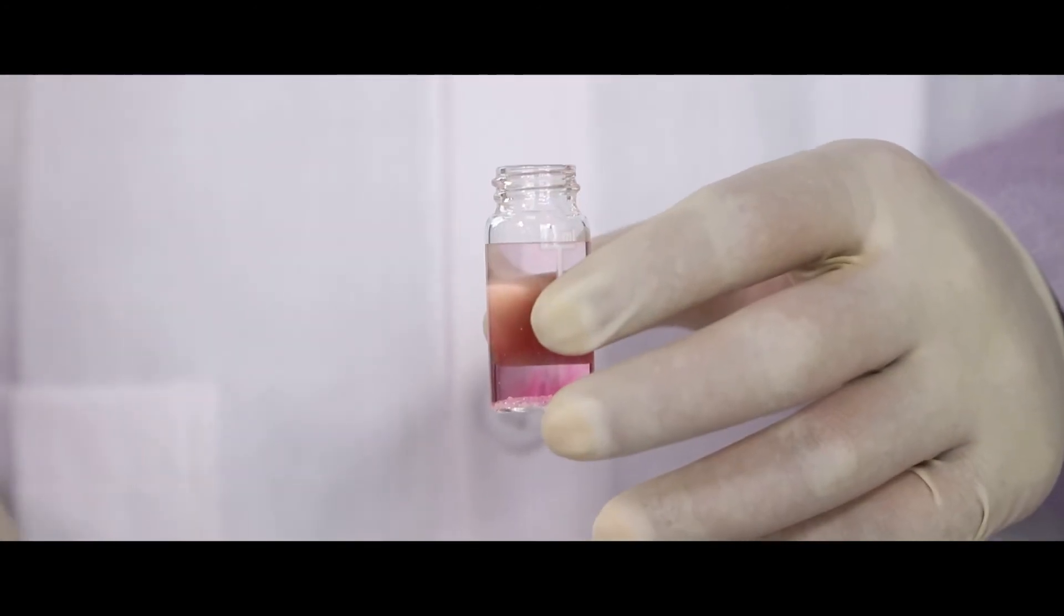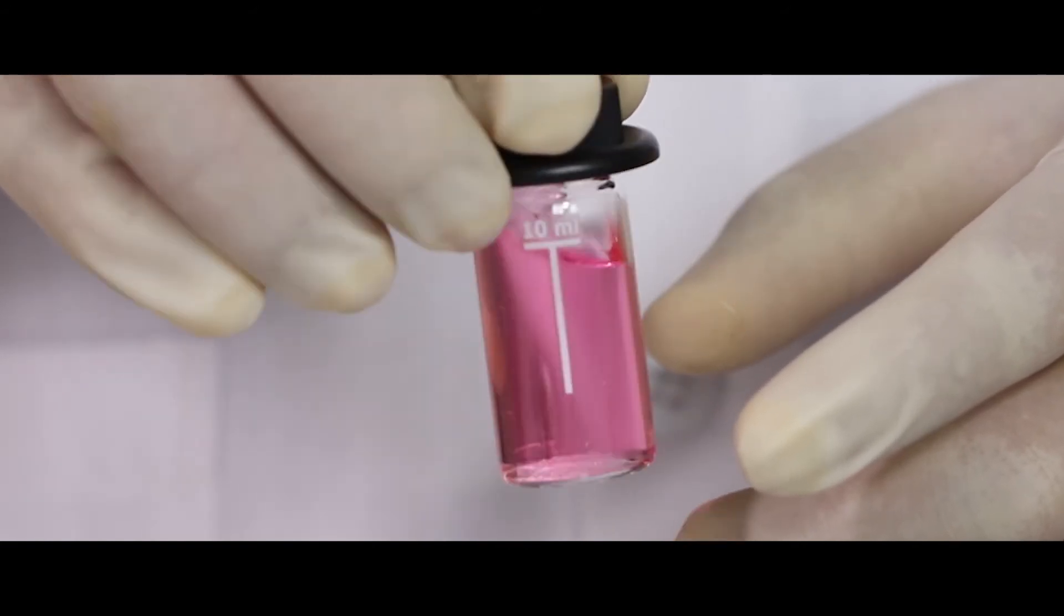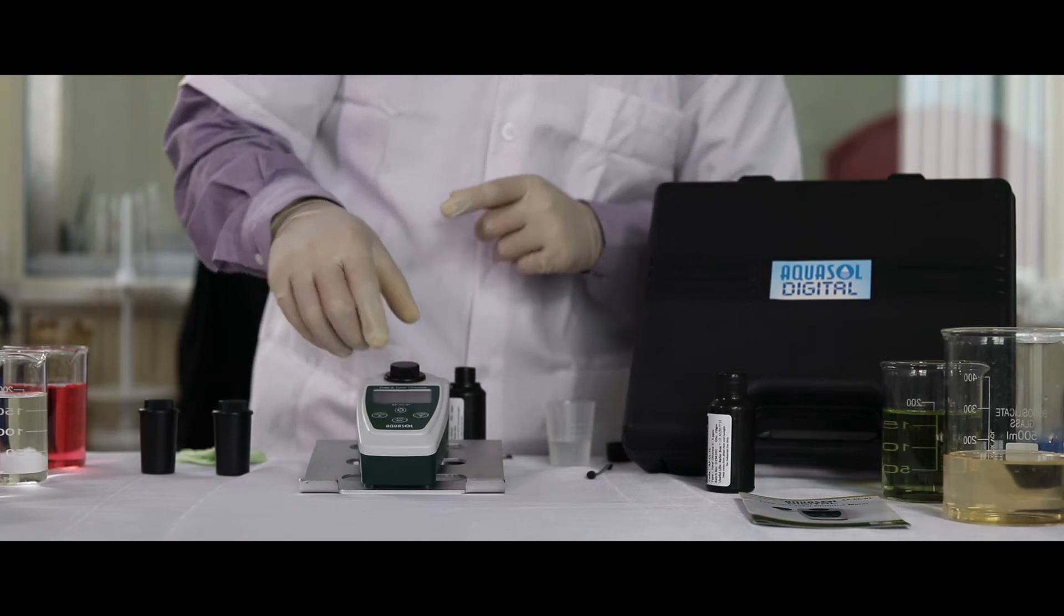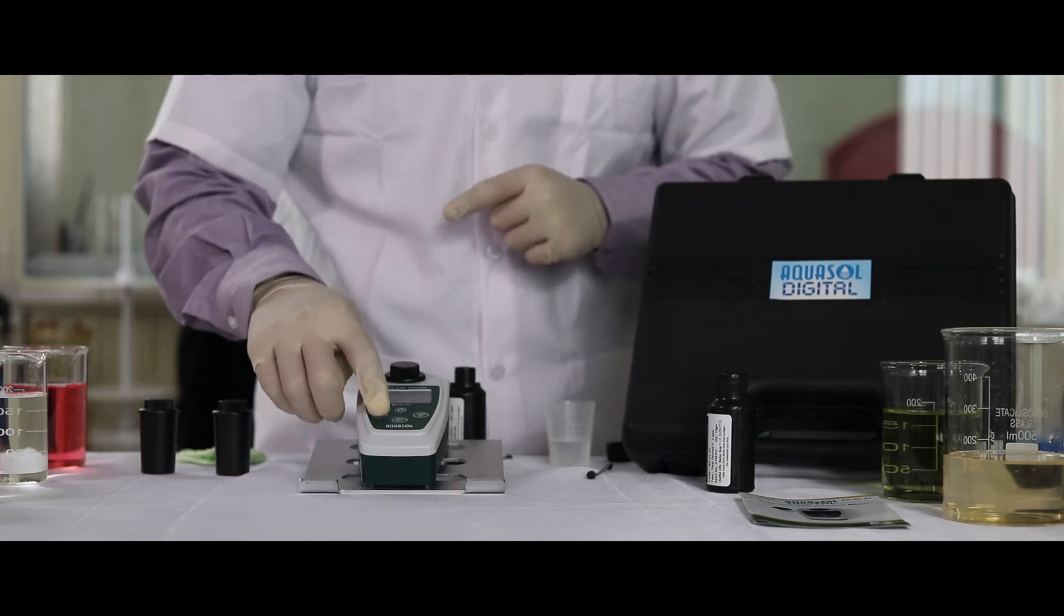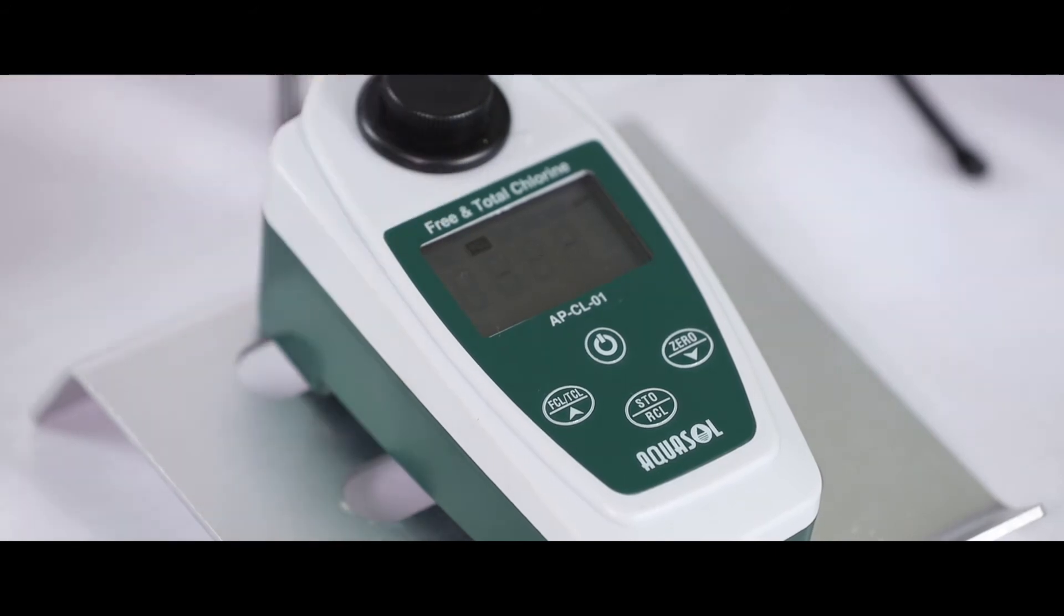Shake the bottle until the reagent is dissolved completely. Align the mark and place it back into the meter and press FCL slash TCL key for reading.